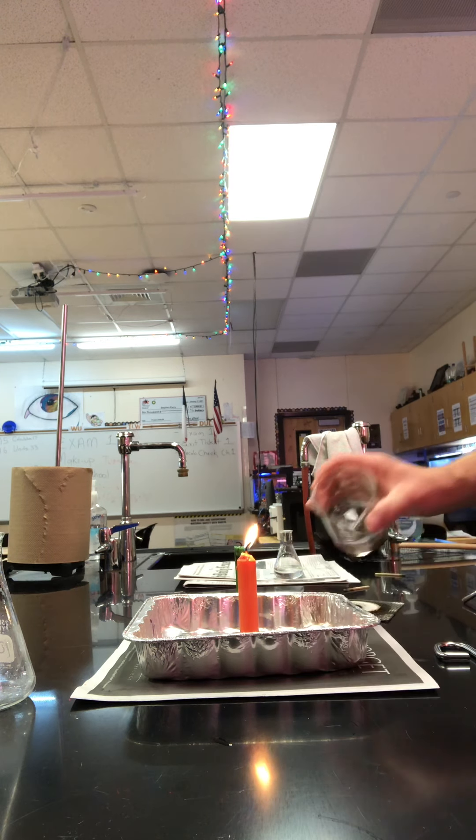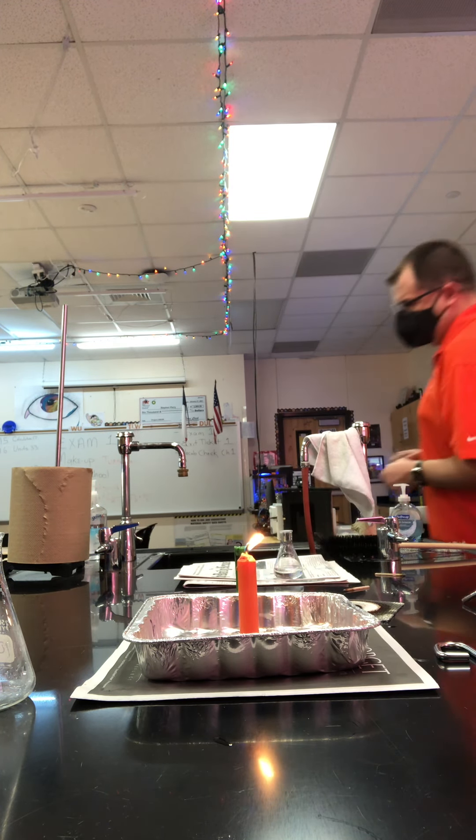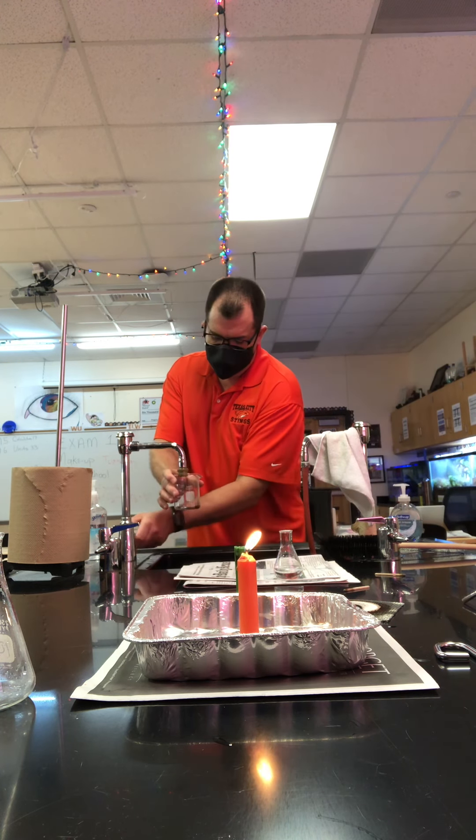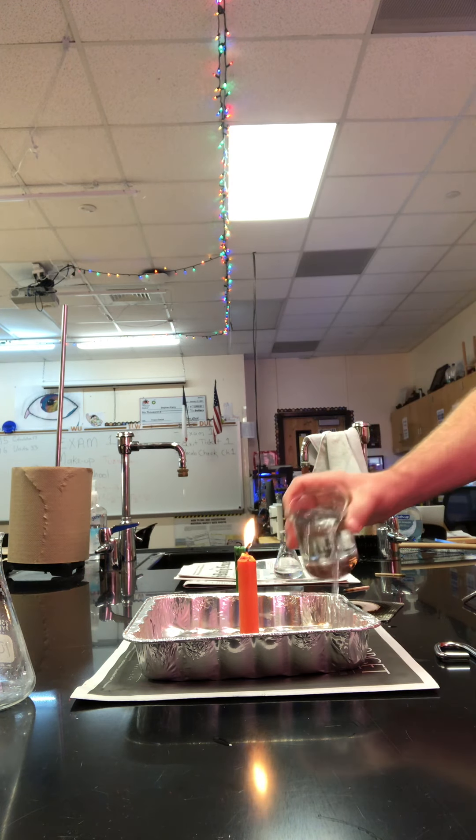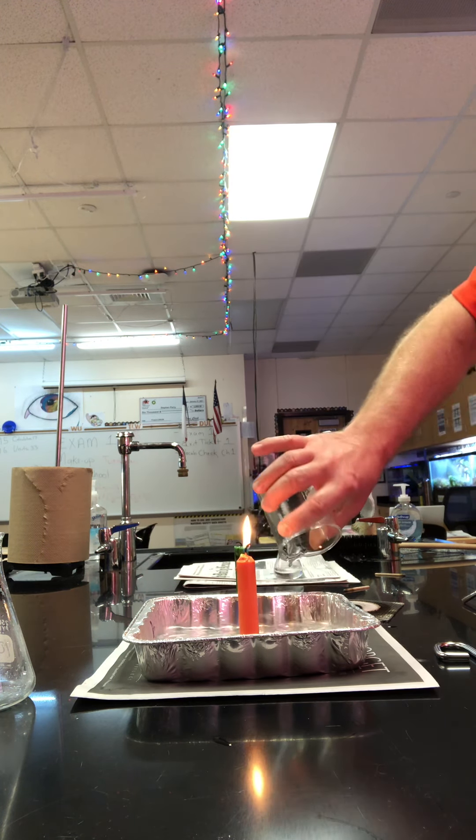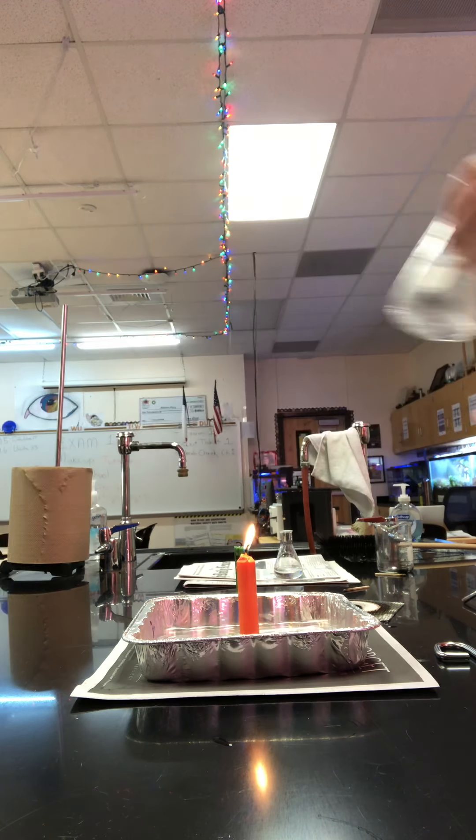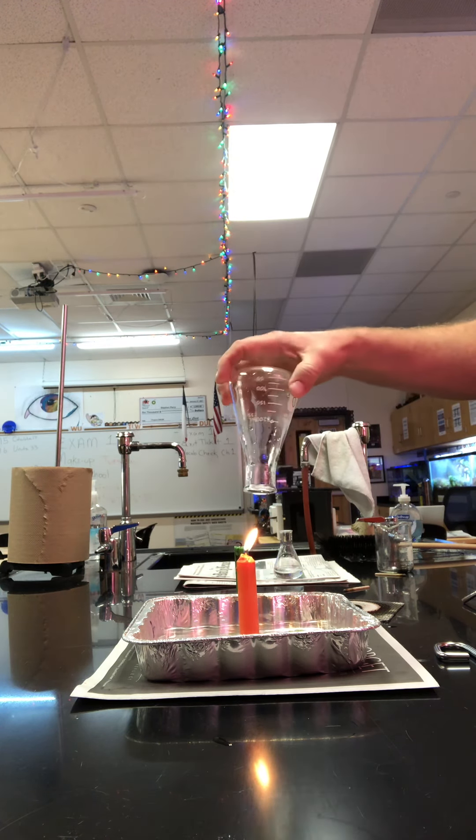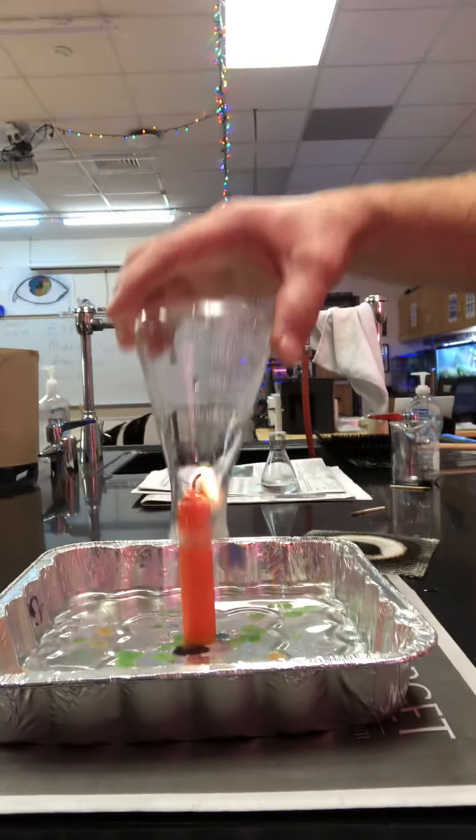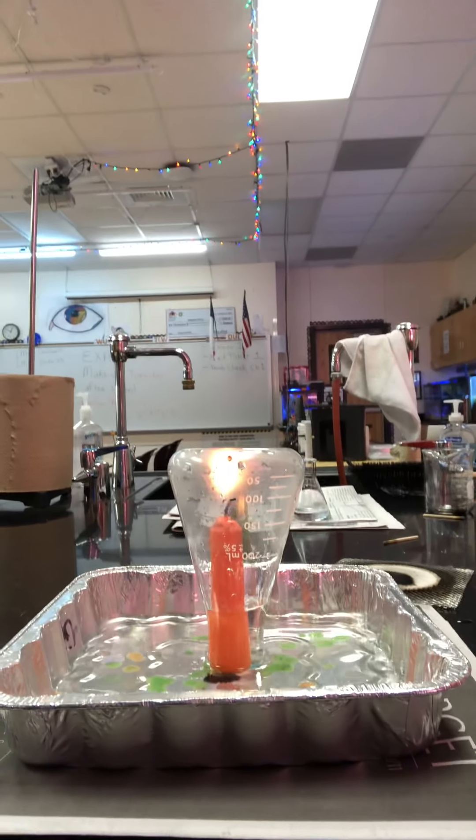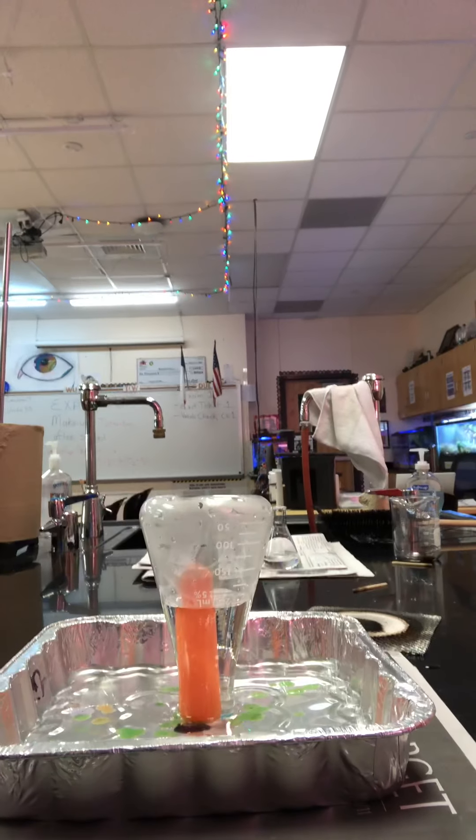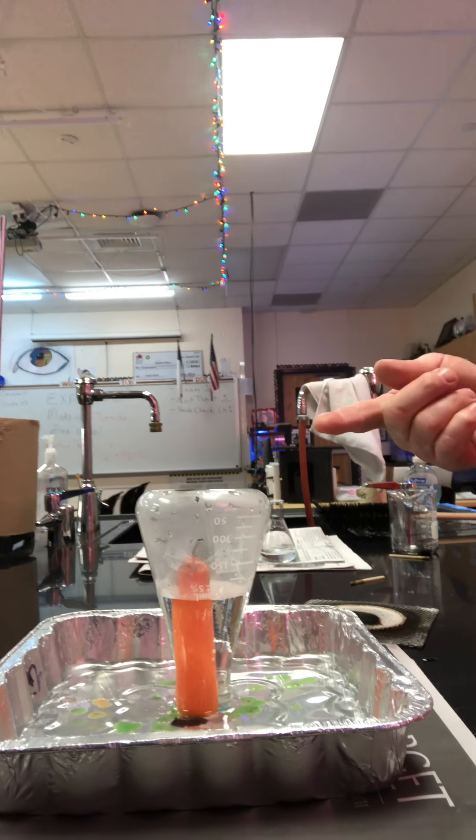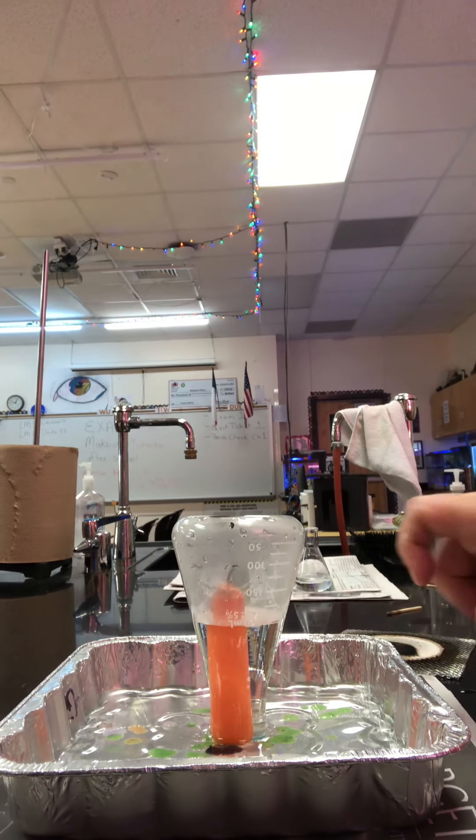So now we're going to put water in the pan. And then we have an empty Erlenmeyer flask. I'm going to stick this over the candle and watch what happens. So flame went out. The water, the flame is burning, consuming the oxygen, turning it into CO2. You can see the water rising up.